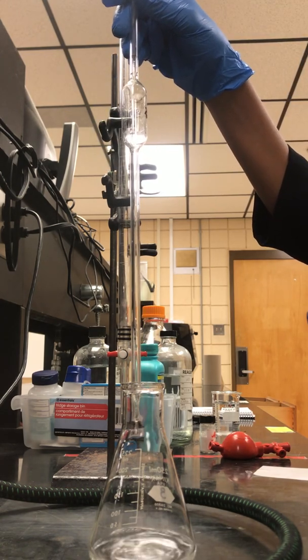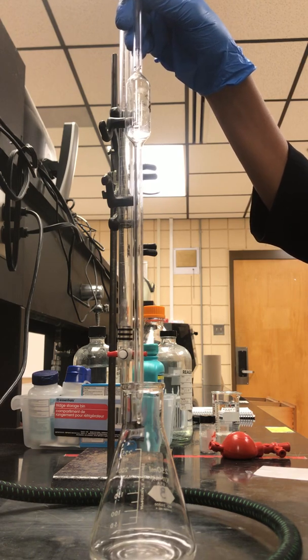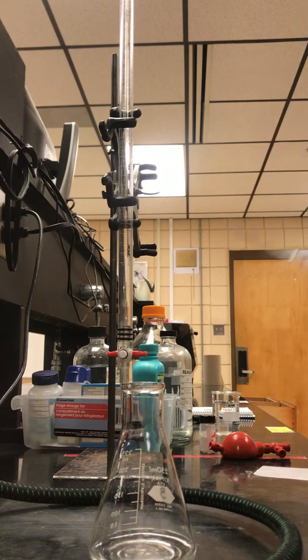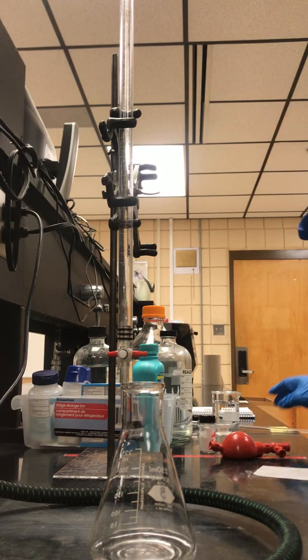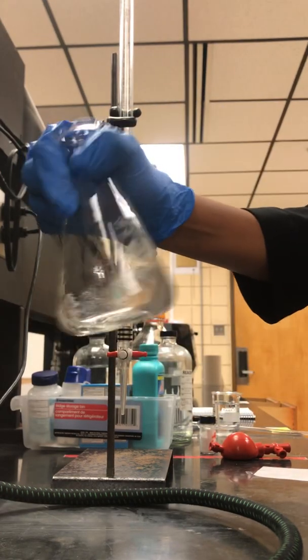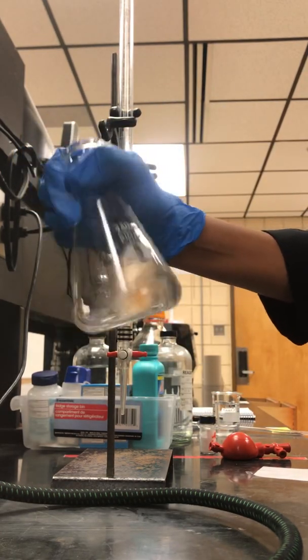Once it stops draining out, you have delivered your 25 milliliters into your flask. Afterwards, you're asked to swirl that flask so you can get your antacid to dissolve.